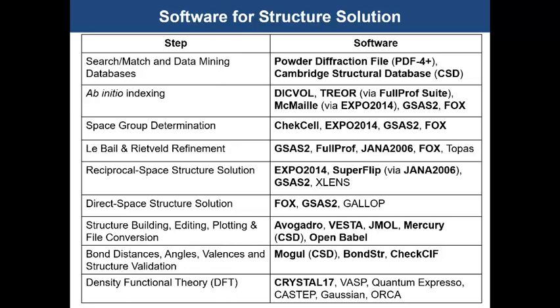With Cambridge, it's very good to check your libraries. A lot of libraries will have a Cambridge structural database license, and you can basically download it and install it on your own computer. The powder diffraction file, not so much. But you can often find at your university people that do have a PDF license and may let you use it.